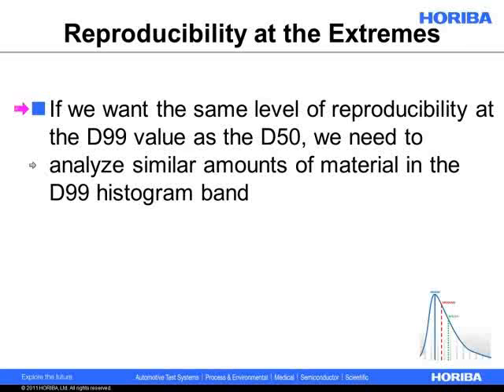And then when you get to dispersion too, if it's a big chunk of smaller particles, we'd call those agglomerates, they may disperse much more slowly than smaller chunks, simply because the amount of surface area available is much smaller. The surface area to volume ratio, I should say, is much smaller. So there's just an awful lot of challenges when you spec out on the edge like that.